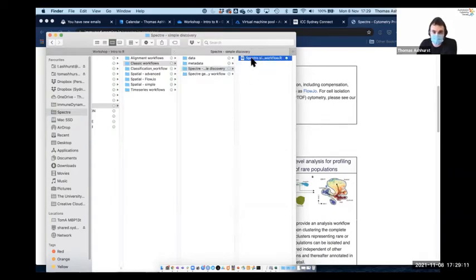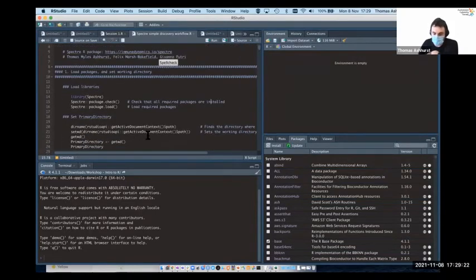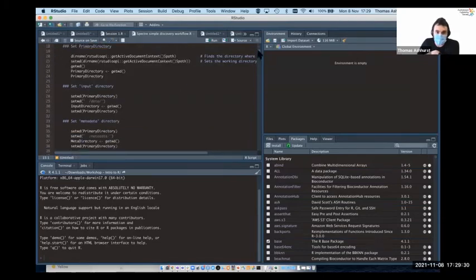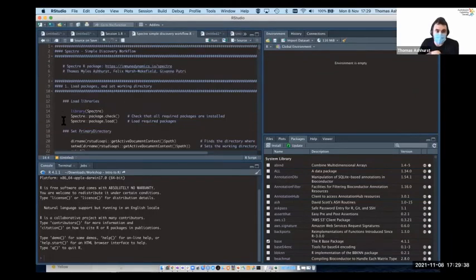And when we open that script, it will look a little bit like this. Much the same as how Giovanna was explaining, we can take this one step at a time. We run the little bits of code bit by bit, and that helps us build up our analysis and get to a point where we're running things at speed. We're not going to go through the whole thing today, but just give you an idea of how this gets going. You can run all of this in your own time if you're interested. All of this is online. But much as Giovanna said, the way we interact is we can highlight a section of code if we want to run multiple lines, or we can just click on a single line and then click run.